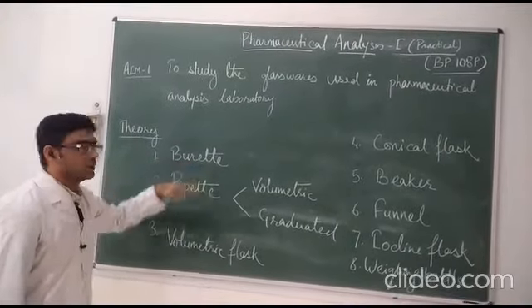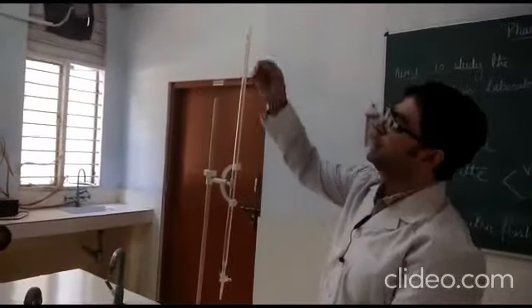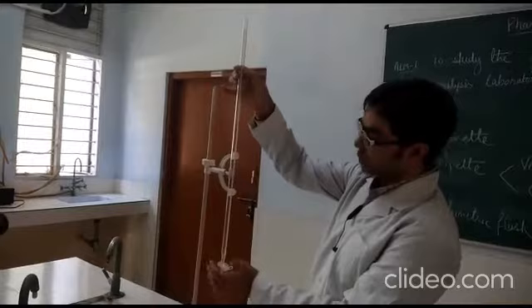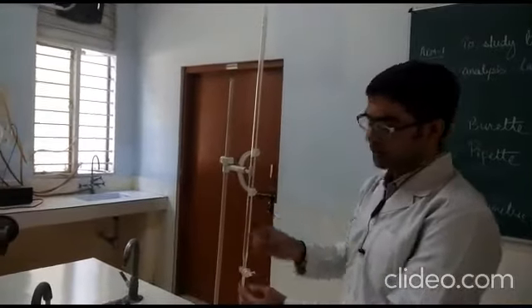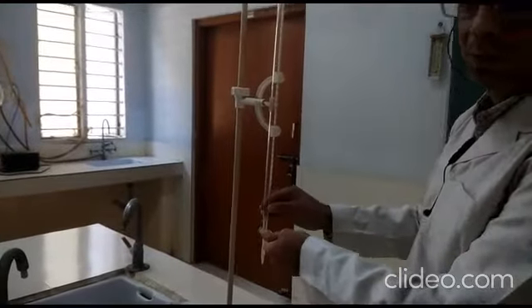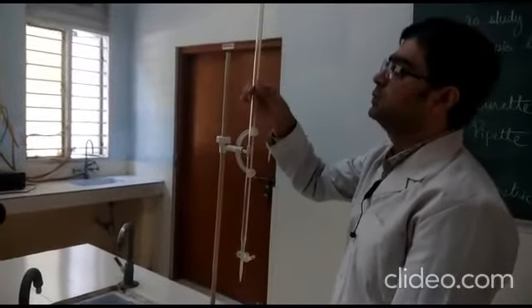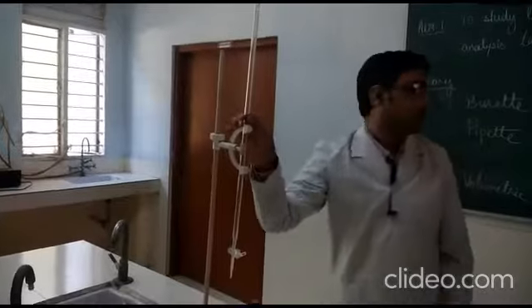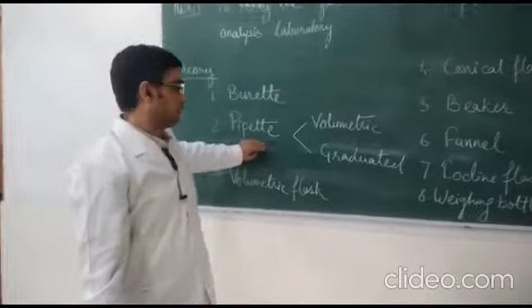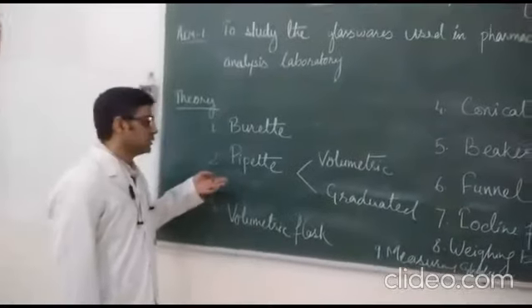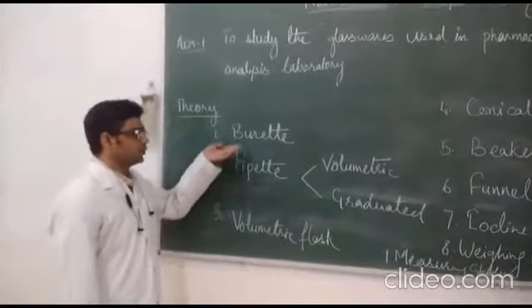First is the burette. You can see the burette placed here. It has markings from 0 to 50 ml and is used for titration. It has a stopcock which is used to stop the solution from flowing out, and a capillary tube tip at the bottom. The burette is held on a burette stand and is used for titration.